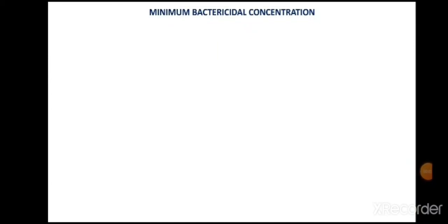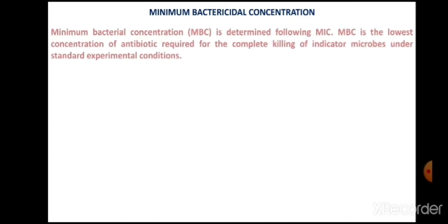Determination of minimum bactericidal concentration. This is a continuation of the last practical of determination of minimum inhibitory concentration of antibiotic. This is determination of minimum bactericidal concentration of streptomycin. It is also called MBC. MBC is determined following MIC.